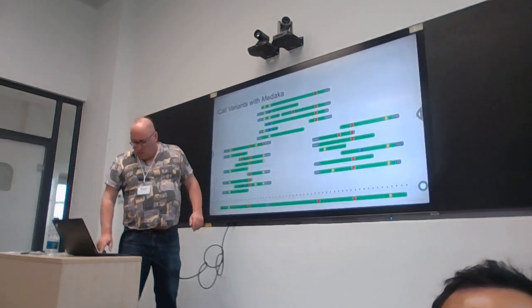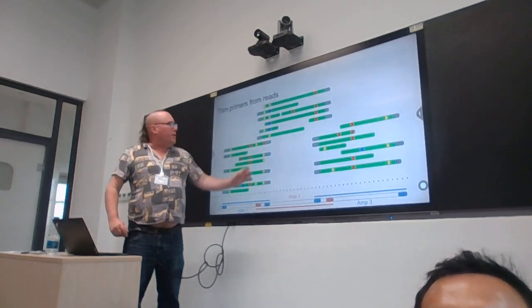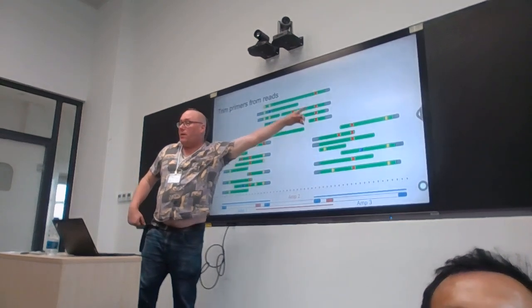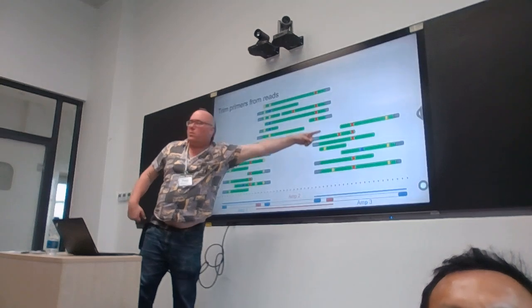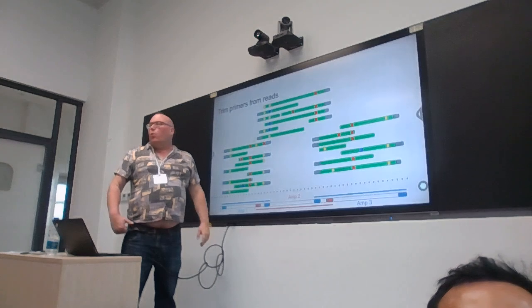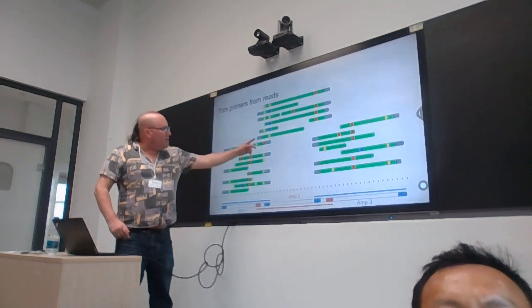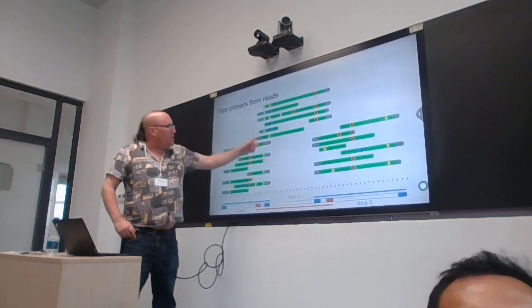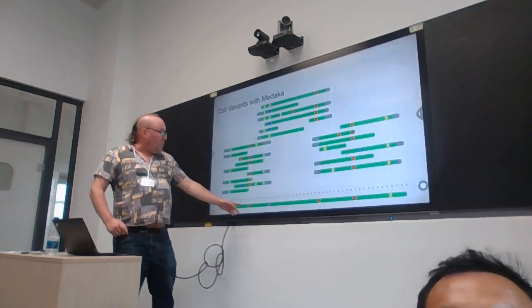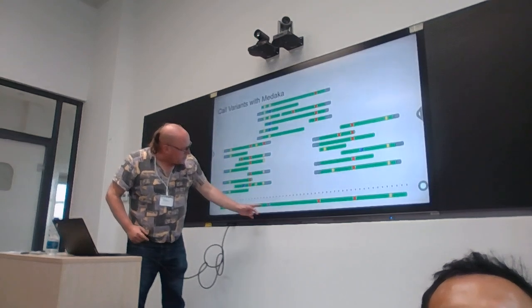Then from here, we look at this, and we see what evidence do we have for variation. Okay, so if we look there, look at that red. Everything is saying red there, right? So we think there's a red variant there, okay? Over here, some yellow, some blue. So now we've got a problem here. Here it's red again, okay? Here, almost all yellow. So over here, we say that this is a red variant. I don't know why that one didn't call a variant. There should be a variant down here.